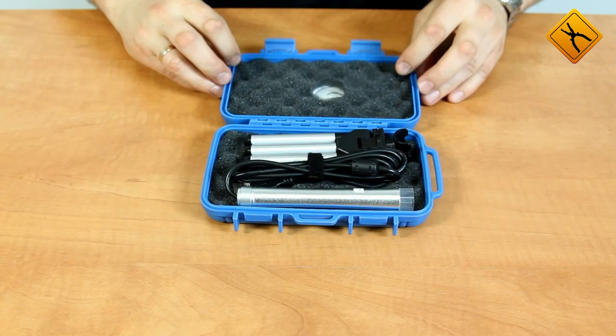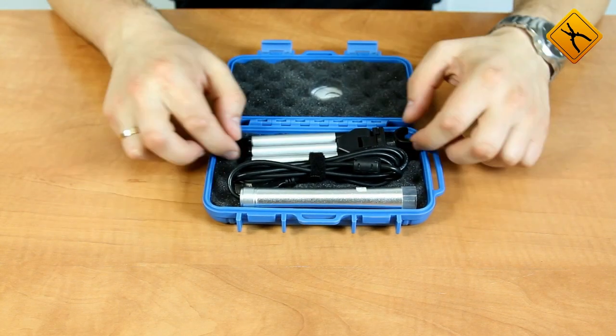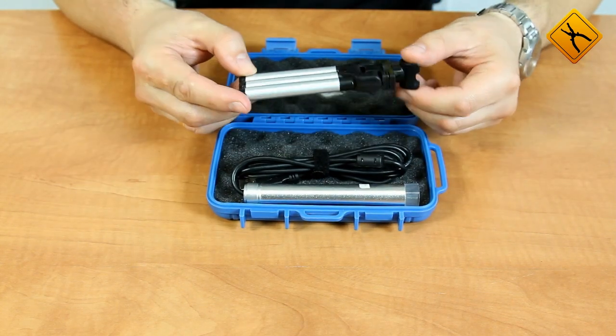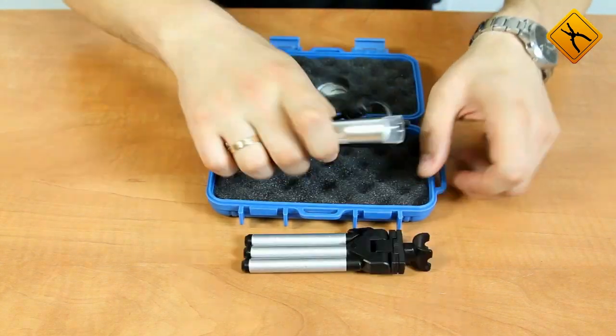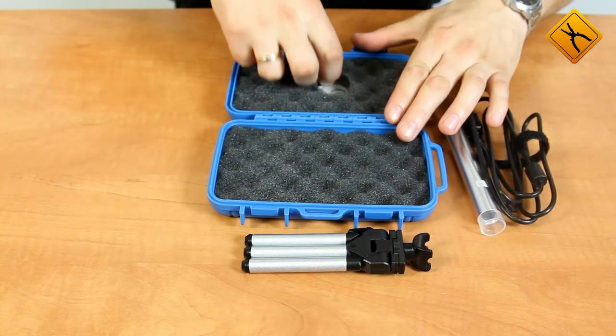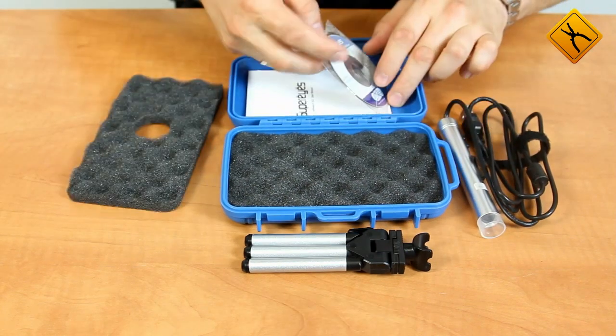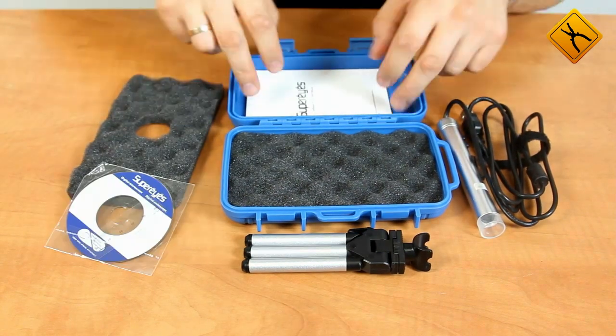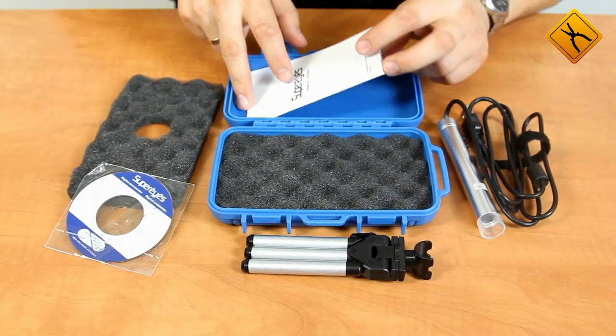The microscope is delivered in a small plastic case. Inside we find a tripod, the microscope itself, a software CD, and a user manual in English.